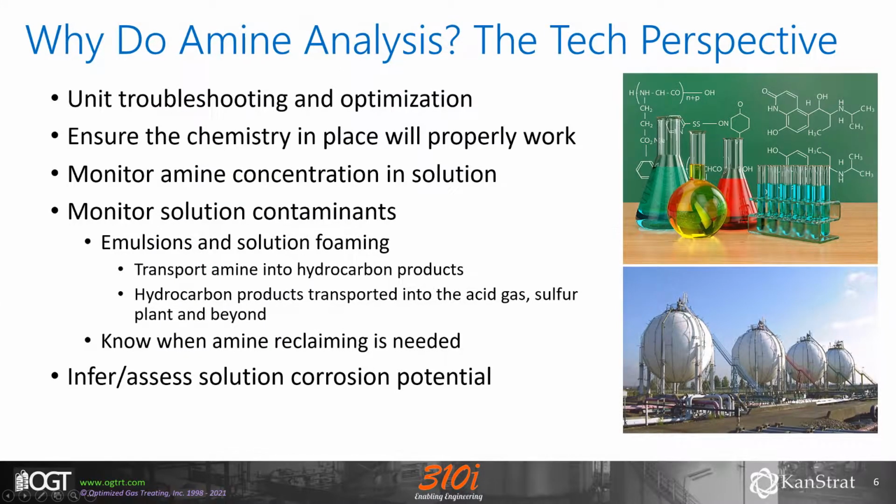Thanks for the introduction. There are really 2 ways to view an amine analysis: the business perspective and the technical perspective. The technical perspective needs to have this for unit troubleshooting and optimizing, as well as ensuring the chemistry that is in place will perform as expected. Monitoring the amine concentration in solution is important to make sure that the amine strength is what it's supposed to be. This will ensure the unit is operating optimally as per the design.